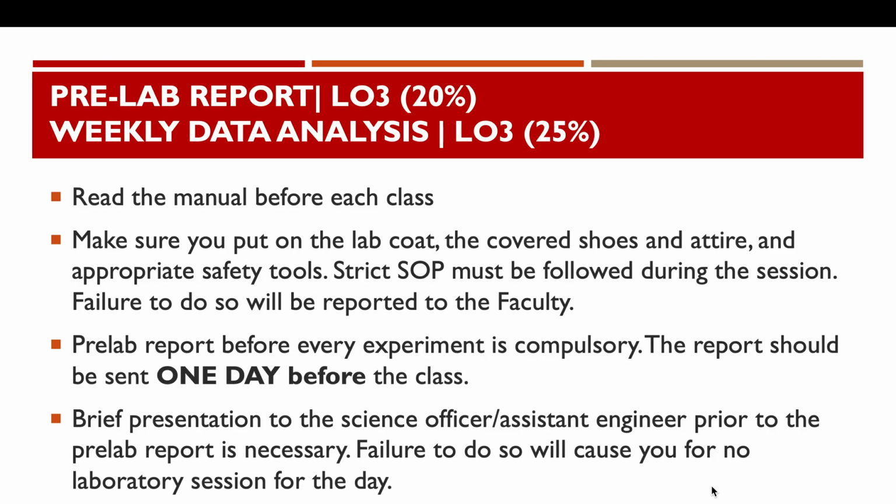Okay, for the pre-lab report and weekly data analysis, read the manual before each class. Make sure you put on the lab coat, covered shoes, appropriate attire and safety tools, and strict SOP must be followed during the session. Failure to do so will be reported to the faculty. The pre-lab report before every experiment is compulsory. The report should be sent one day before the class for you to be able to enter the laboratory. If not, you will be denied permission. A brief presentation to the science officer, assistant engineer, prior to the pre-lab report is strictly necessary. Failure to do so will cost you the laboratory session for the day.